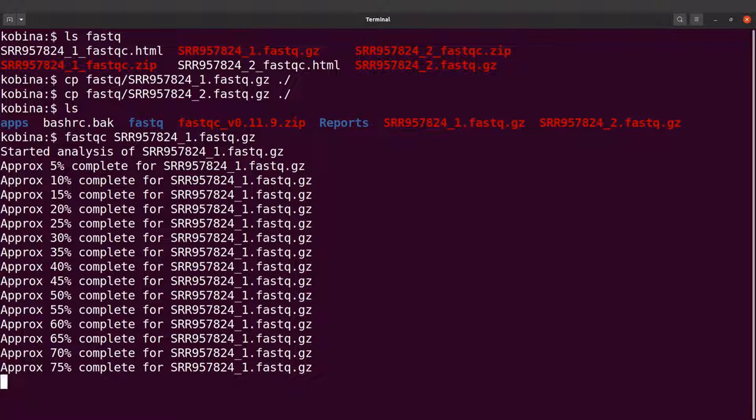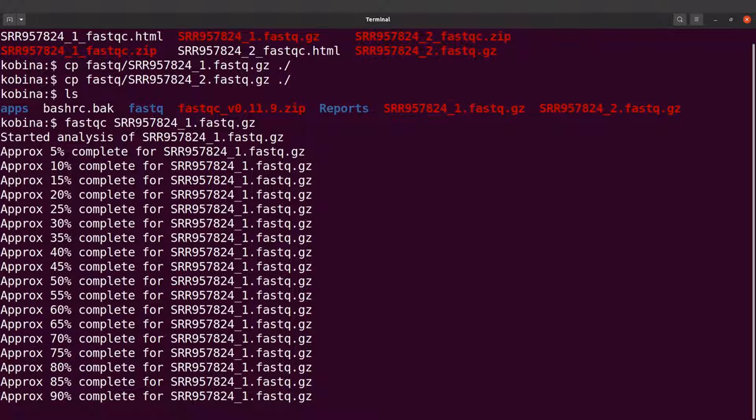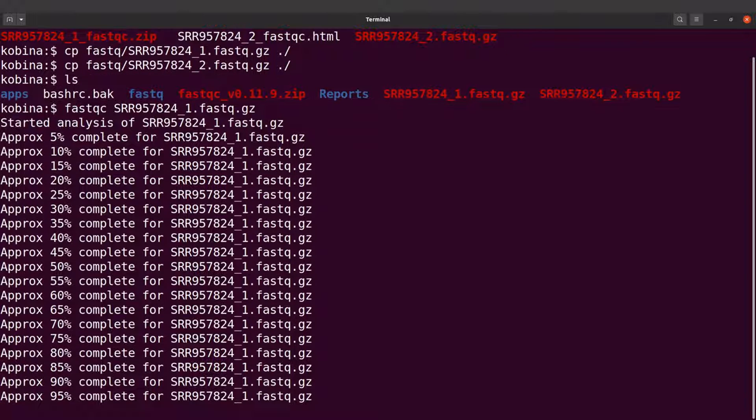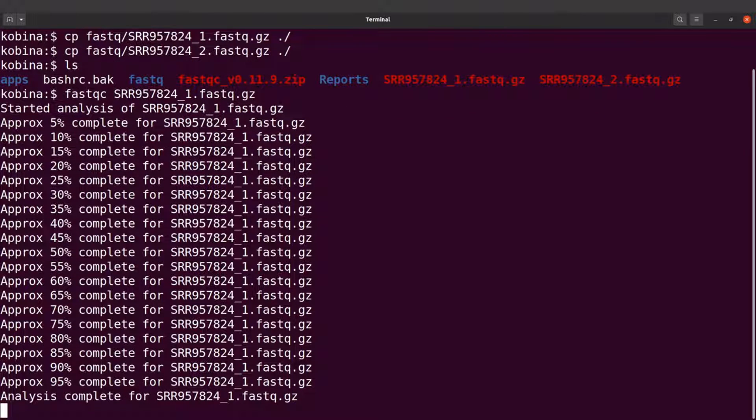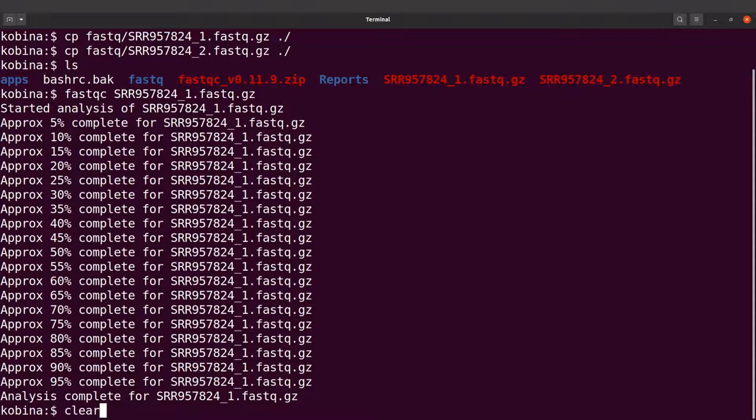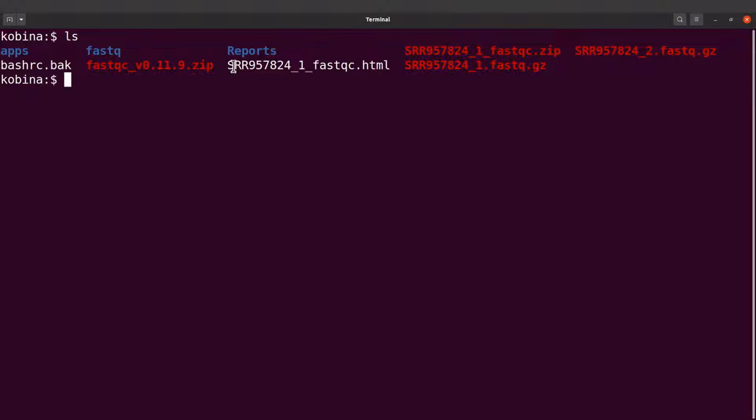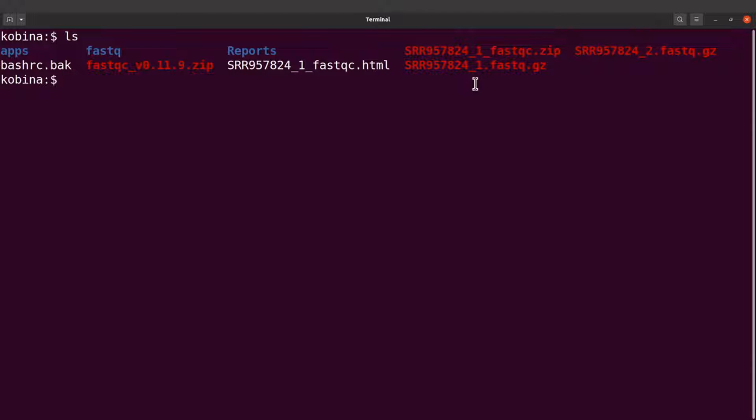That's also done. If you do an ls, you will see an HTML file here which has the report. There's also this one here which has some information that FastQC has generated. These are HTML files. Let's open them using the file manager to open one of these HTML files.